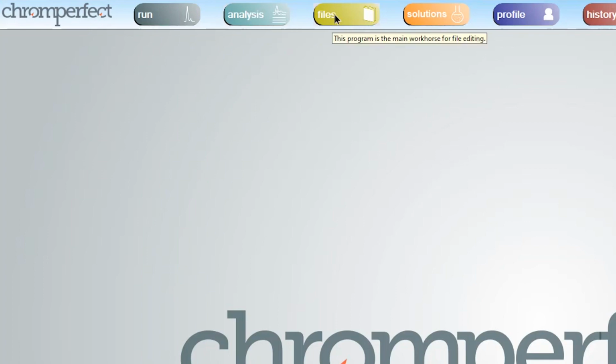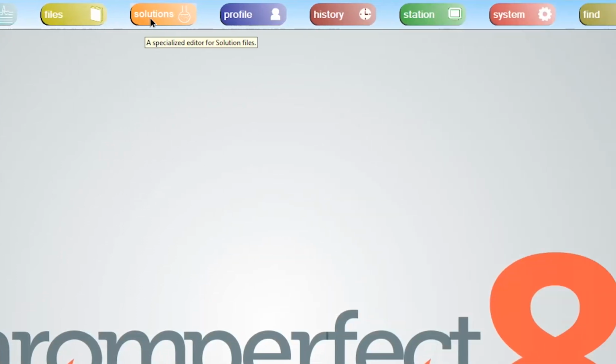Files, previously the file editor, creates, edits, and updates method and other files. Solutions is a new program for version 8 of Chromperfect which is used to create consolidated acquisition files. Solution files contain method, calibration, and report format files within a single file. The Profile Editor program maintains the user search directories. The History program displays contents of the data, error, and alarm log files.